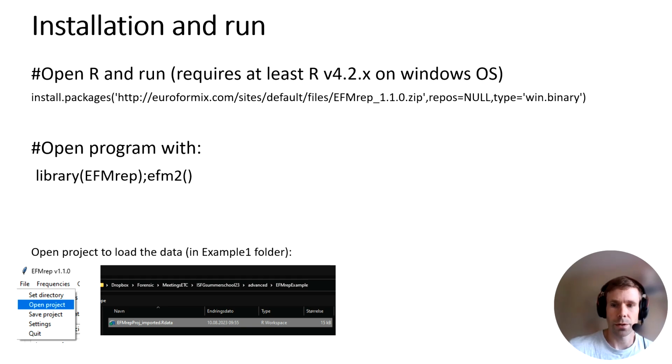A quick view of how to install and run the program is useful, and also how projects can be saved as a file when you are doing your analysis in this tool, and you can open the project again after you have closed the program.